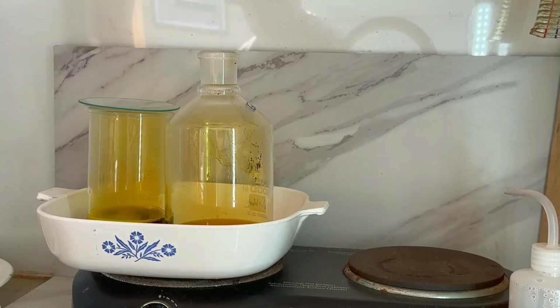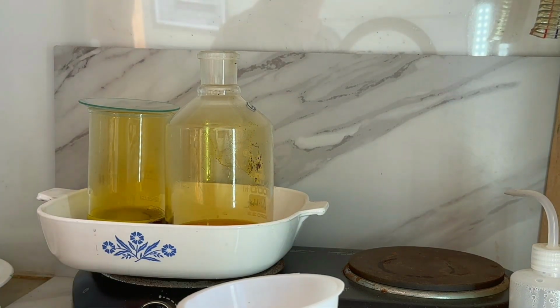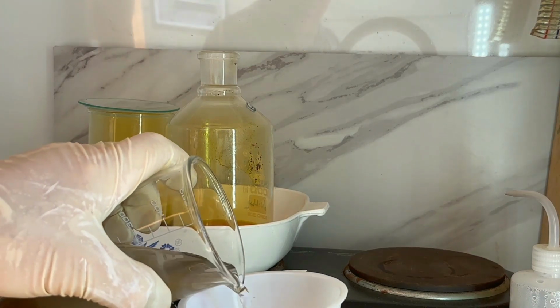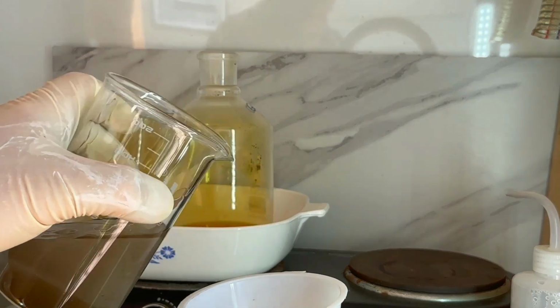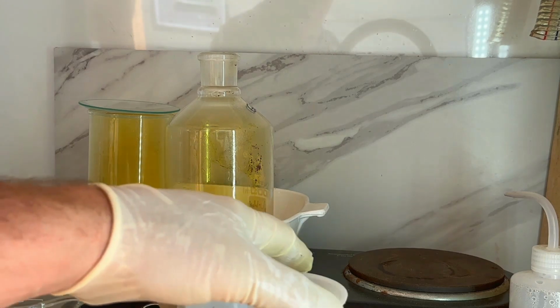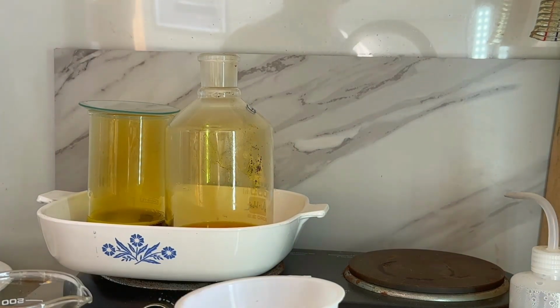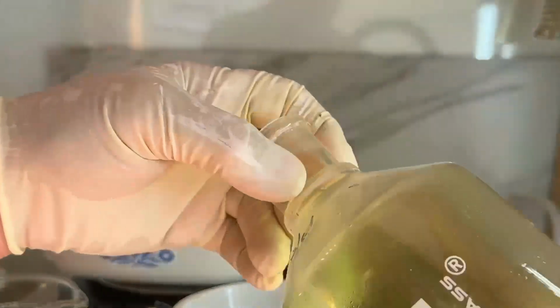While that's going, we're going to go ahead and grab a filter here, and we're going to filter what we poured off there, capture all that little bit. You can see the water's a little cloudy. We're going to capture that. We're going to try to process all of this leftover stuff, so we're going to filter that.